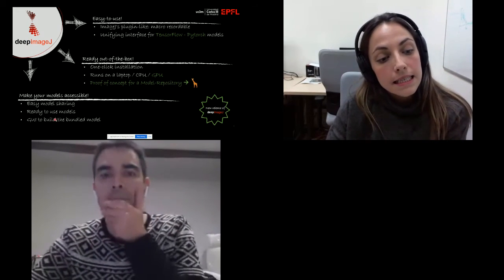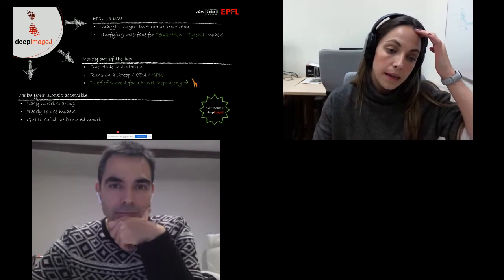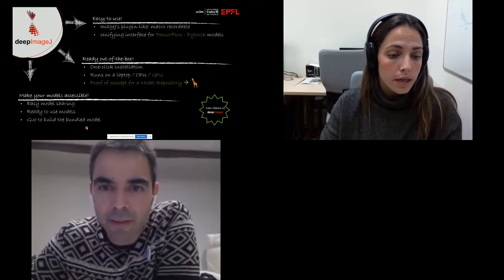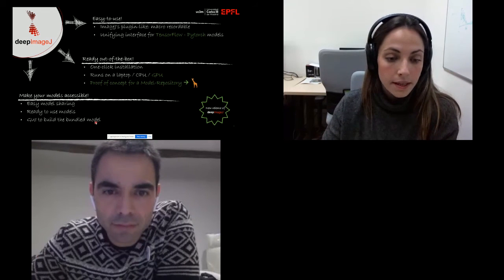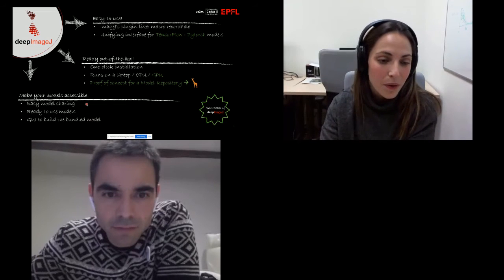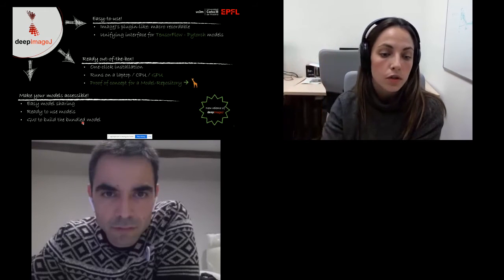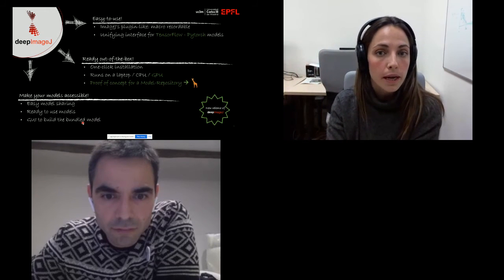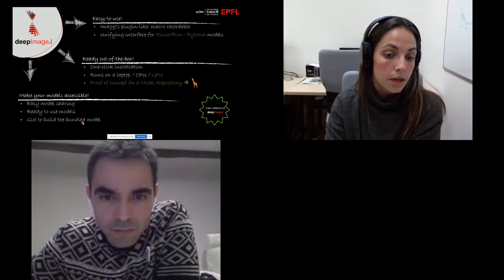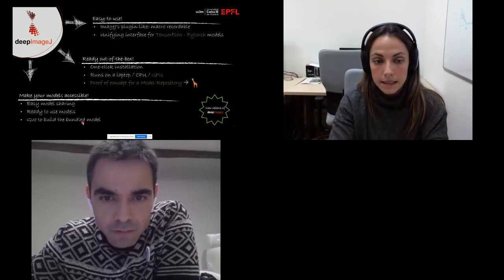And the last thing is that with DeepImageJ, as a developer, you can make your models accessible. This means that they're easy to use, they are ready to use, and even if you think that it's difficult to create the bundle model as in the Python code, we have also created a graphical user interface to build it. So it's like 2 minutes and you can provide your model together with your publication or to your collaborators without spending too much time on working on a user interface or anything else.